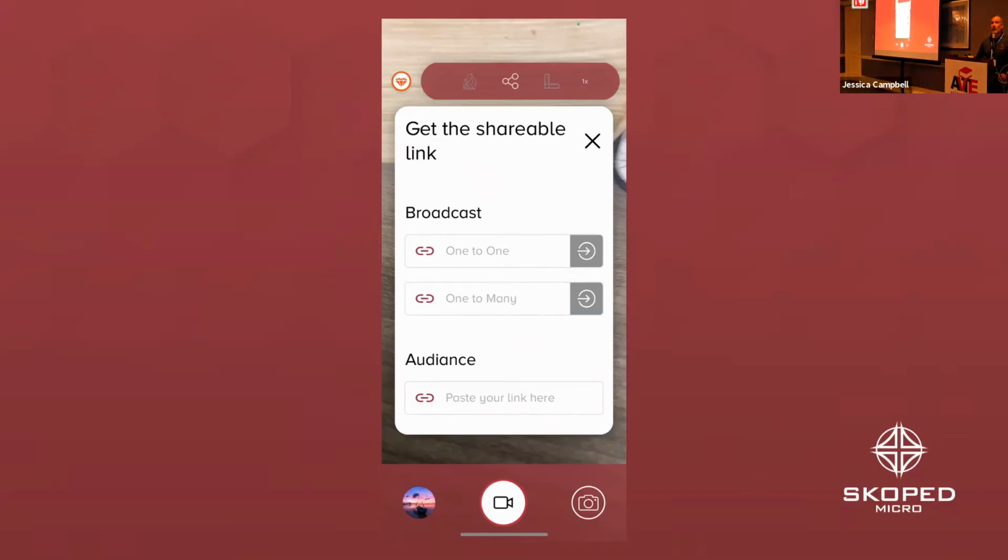So this is our first mass try. You guys are guinea pigs, and so far so good. I knew about some of the update things, but I didn't know how many people would be involved. The fact that we can broadcast our screen right now, I'm pretty happy with. I wish you could see my micrometer because it's really cool. When you download the app, you can show it on your own phone and play with it too.